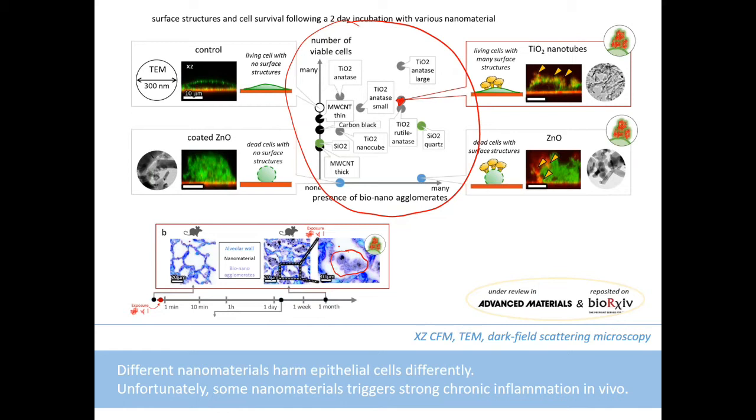You can identify here that the blue color is the epithelial cells, and this light violet color is sort of organic matter inside the alveoli. So you can see that we can actually identify similar surface structures all over the sample after the exposure with the same material.